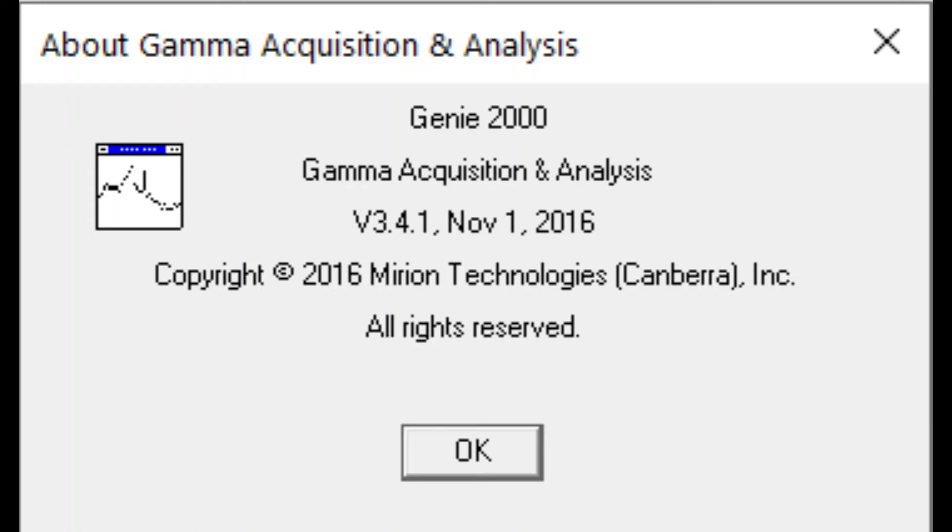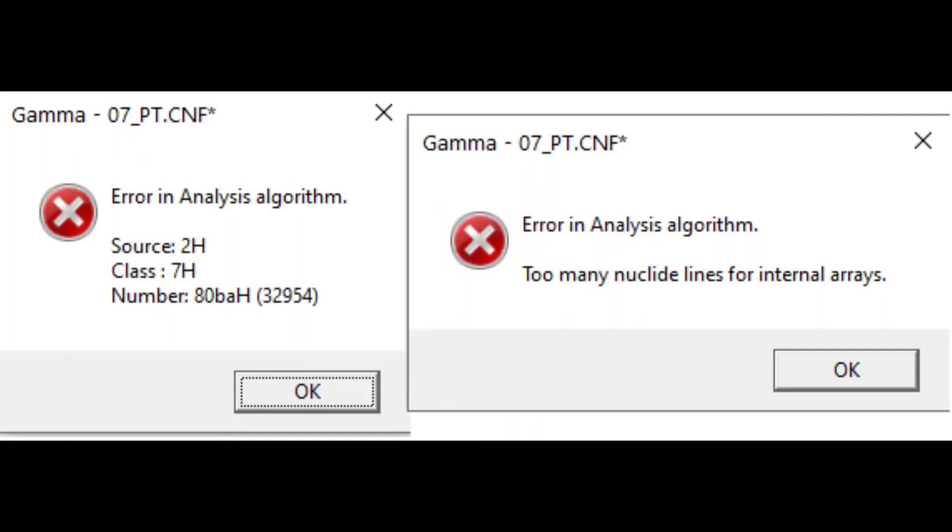This video is aimed at people who, like me, know what their spectrum should contain and need to use Genie to get the activity of more than 10 nuclides from the spectrum.